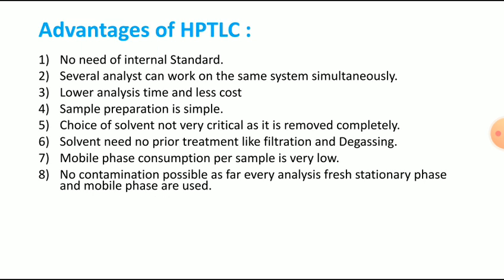See, this is actually a very nice criterion of HPTLC, because for each and every analysis of the sample component we are using a fresh stationary phase, or we can say a new HPTLC plate, and the new mobile phase. So there is no possibility to contaminate the stationary phase as well as the mobile phase.